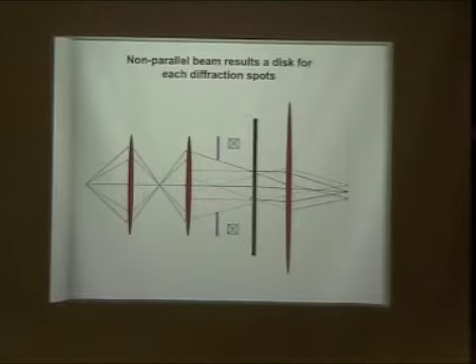So that's why, when you set up your beam, say your crystal is only this big but your beam is this big, you cannot just focus your beam to the size of your crystal, not use an aperture, and then generate a diffraction pattern. In that case, sometimes you do get what we call convergent beam electron diffraction, where you see a disc rather than a sharp spot. So this is another reason why you need a parallel, well-focused beam to get a sharp spot.